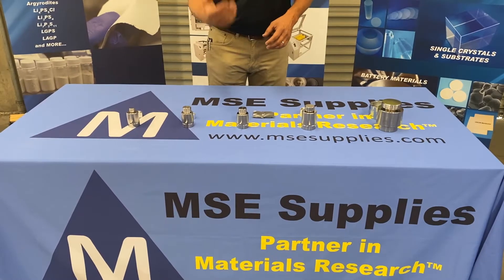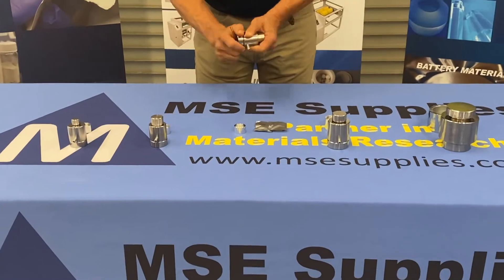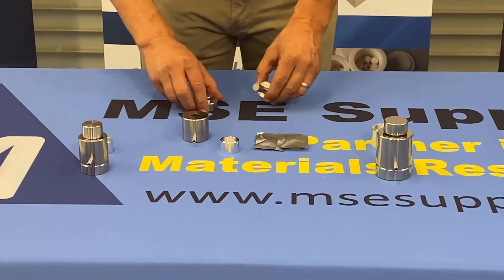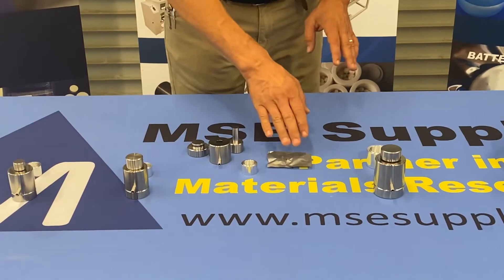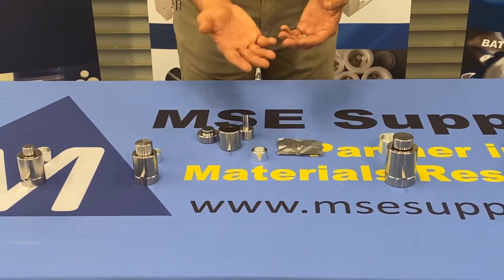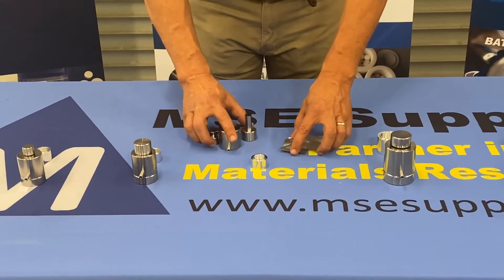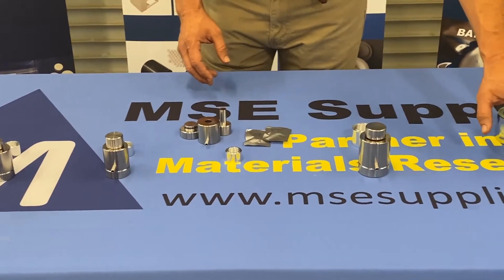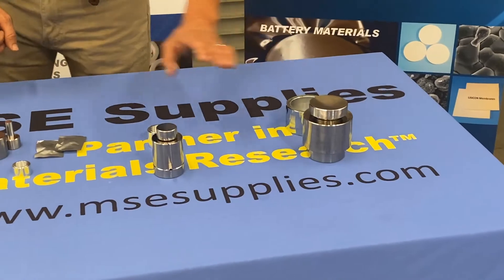When you order the pellet press from us, what you will receive in the set is the die sleeve, the base plate, the plunger, and two spacers. The spacers are separately packaged because one side of them is highly polished. That polished side, when you insert it into the sleeve, needs to be the side touching the powder. You also have the release cap — so those are the five pieces you will have when you order a set from us. Note that the large two-inch die does not come with the spacers.